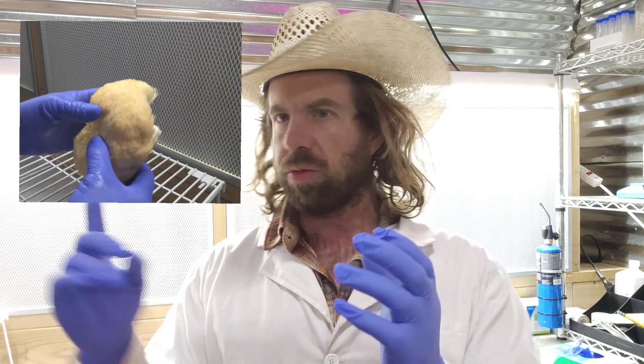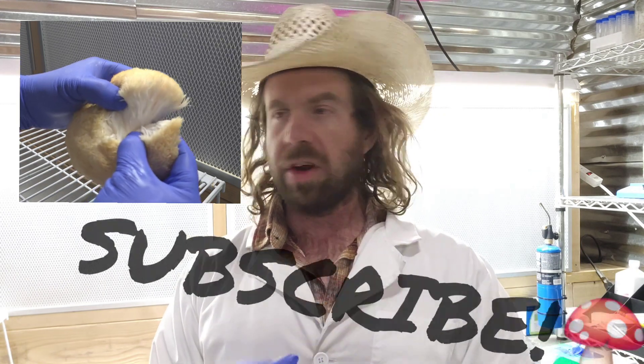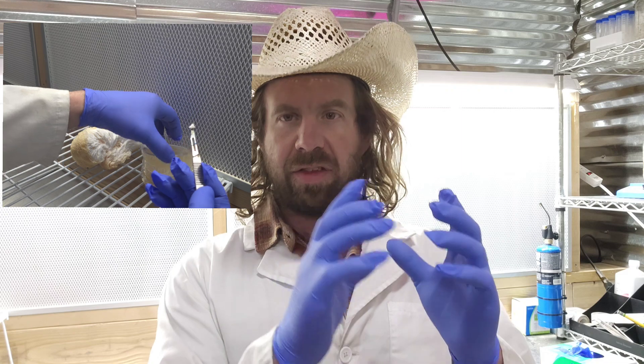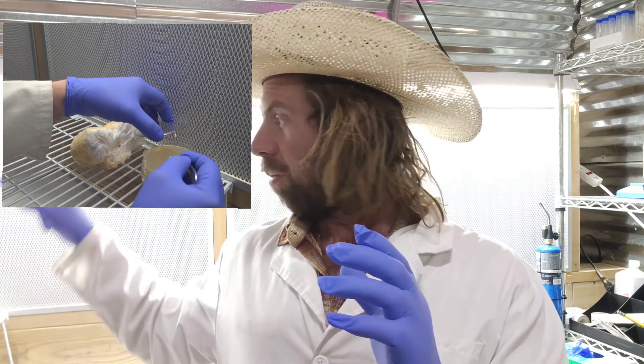We're doing this here in a sterile environment. I'm in my lab and I'm going to split open these mushrooms in front of the flow hood. I'll take a sterile tissue sample out of the inside of the mushroom and place it onto a clean petri dish of agar, then allow it to grow out. Typically it takes about two weeks for the mushroom to fully colonize that agar plate.